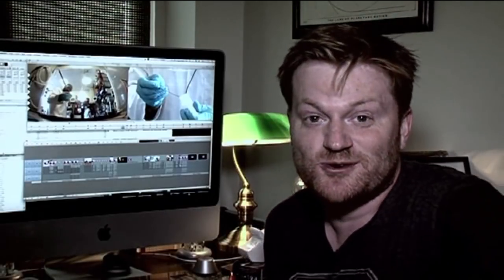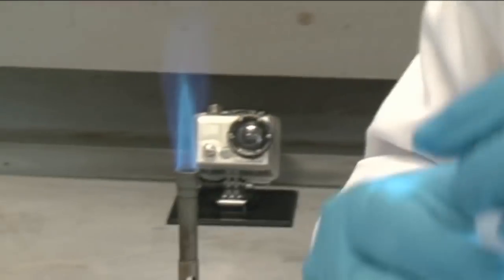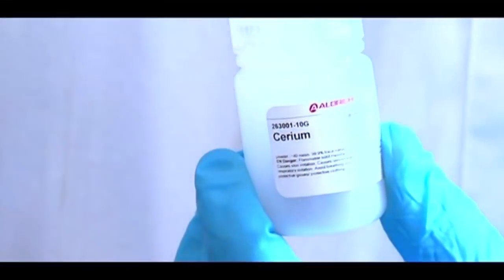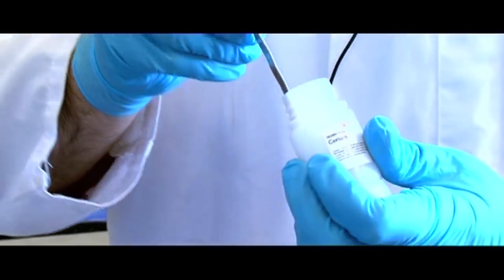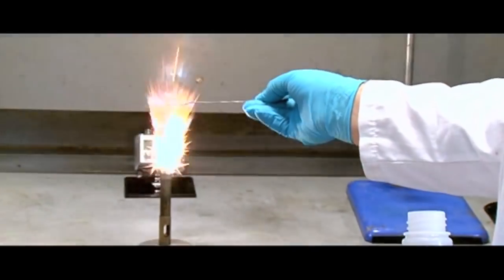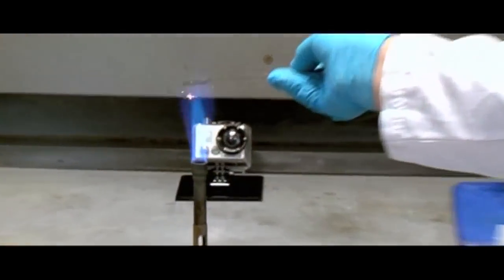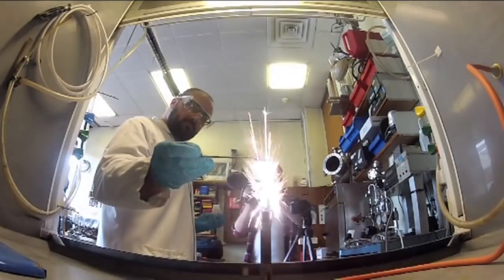Lastly, the metal cerium, which we ordered in specially from our friends at Sigma Aldrich, and Michael put it into a Bunsen burner. This is powdered cerium, a metal that when exposed to a flame produces a very beautiful sparkle. Ta-da! Science.